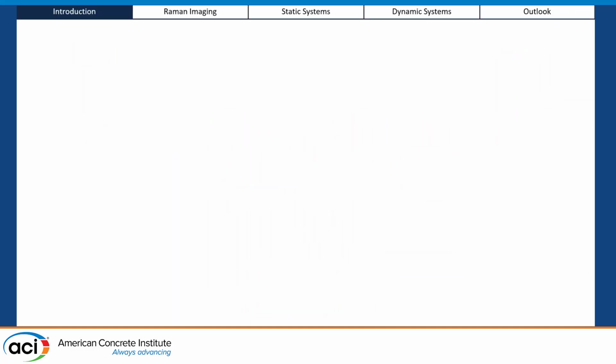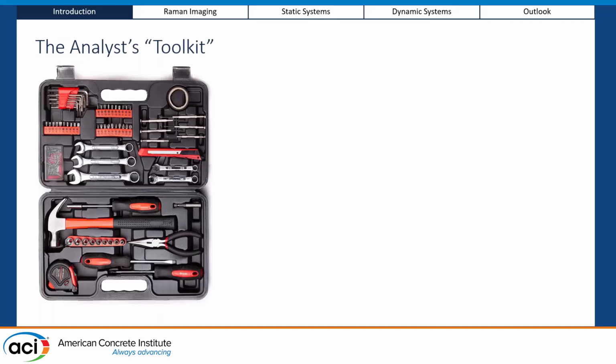Well, the first thing is we're going to start with a little bit of introduction. Why are we doing what we are doing? And then how I've broken down this talk is really the two main sections, static systems and dynamic systems. By static systems, we mean systems which are stable, not moving over time. So we're looking at a picture which is not moving, and dynamic systems are things which are undergoing changes.